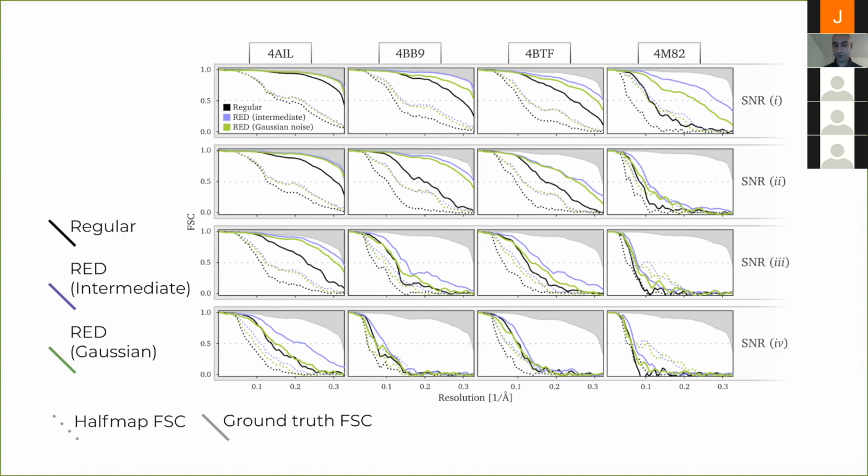But if you look in the preprint, you can. I don't remember the name right now, but it's called a residual denoiser, or a residual UNet, I think. Okay, and, thank you very much.